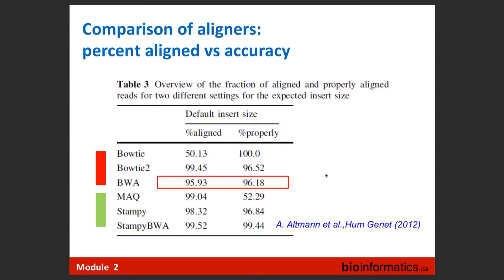And then I feed this into the aligner with the same human genome. I also can add random SNPs to those reads and do many things. But the easiest is just to feed it and see how many reads out of my synthetic data set will be aligned properly and how many are not. This is a good exercise. That's what people did.